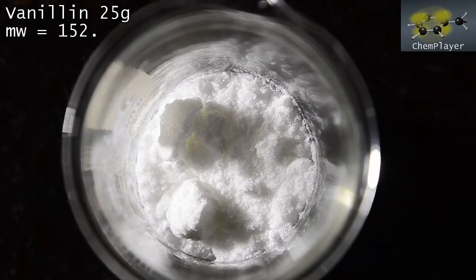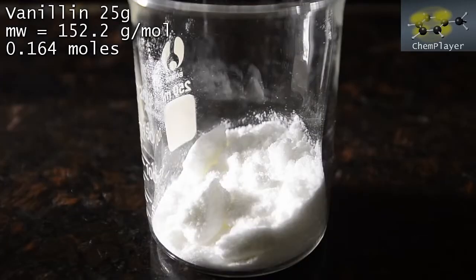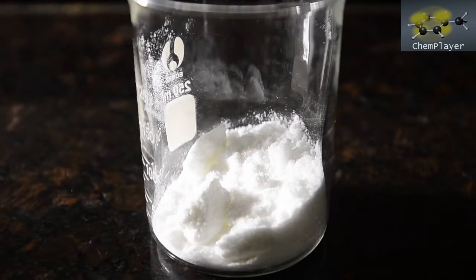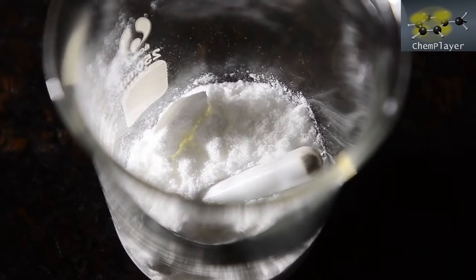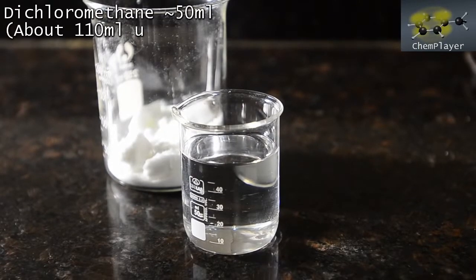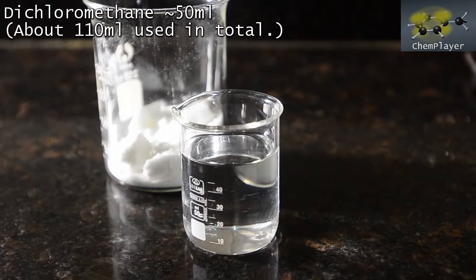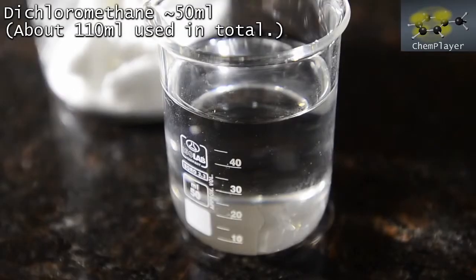Here we've weighed out 25 grams of vanillin powder into a 250 ml beaker. Let's get a stir bar in. Now we're going to dissolve the vanillin in a solvent. We're going to use dichloromethane because it dissolves it fairly well, and also because it shouldn't react with the nitric acid we'll be using. Here's about 50 ml of dichloromethane to start with, but as you'll see we needed a bit more than this. So let's get this in.